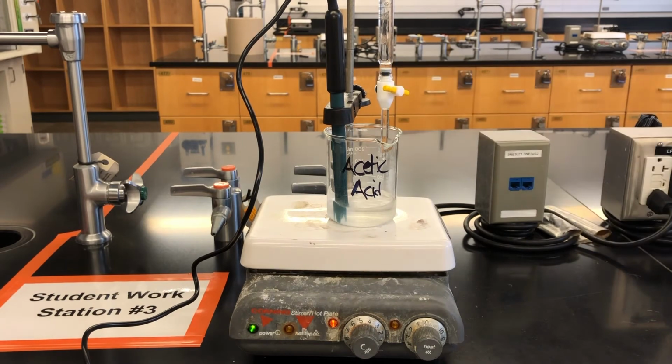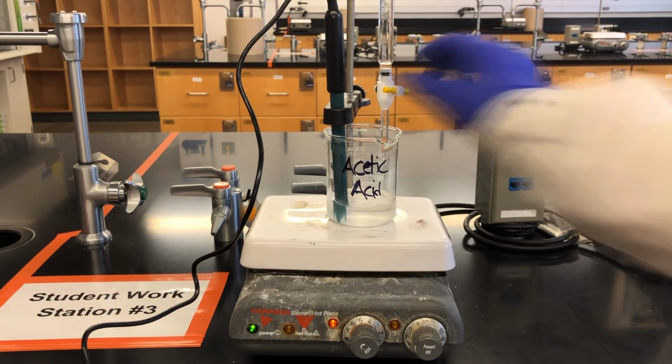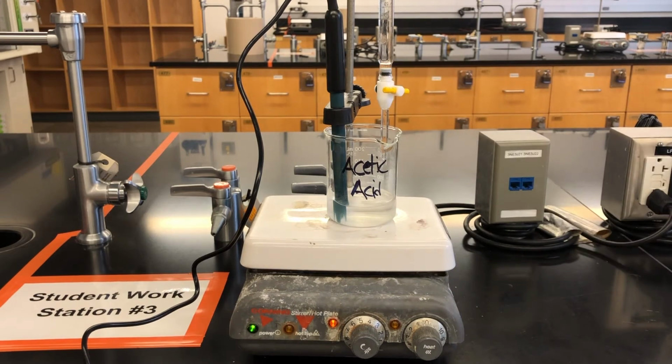As we approach the equivalence point, we decrease the amount of titrant added between each data collection point from 1 milliliter to half a milliliter, 0.2 of a milliliter, and then finally to dropwise additions. After reaching the equivalence point, we add a further 6 half milliliter portions, recording the pH each time to finish out the titration curve.